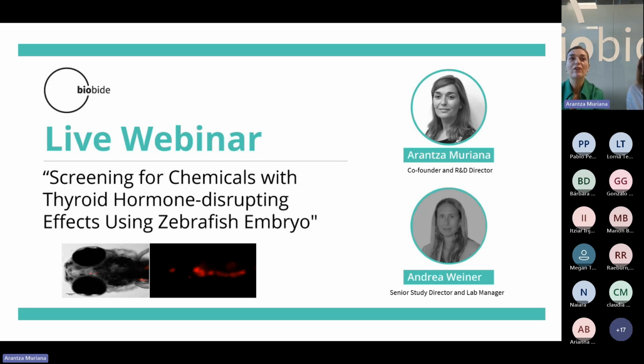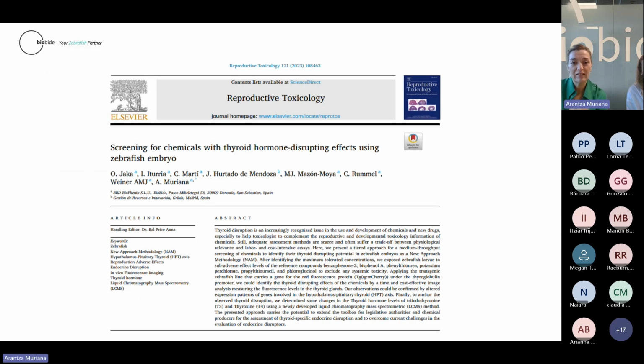Thank you very much for sharing your time with us today in this live webinar, where we will be talking about the screening for chemicals with thyroid hormone disrupting effects using Zebrafish Embryo, based on our recently published paper from Elsevier in Reproductive Toxicology.